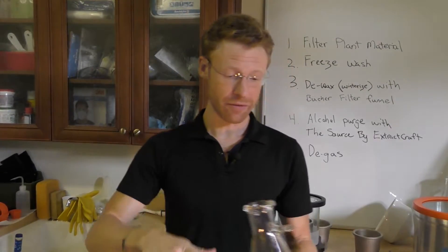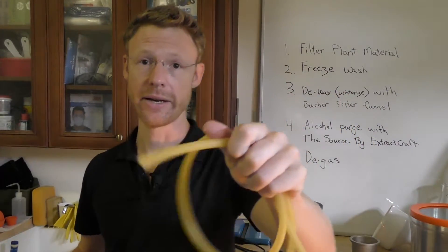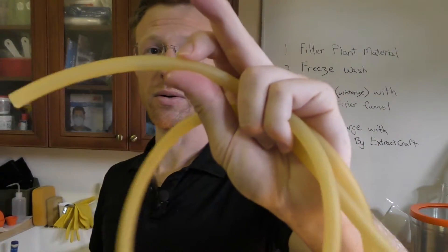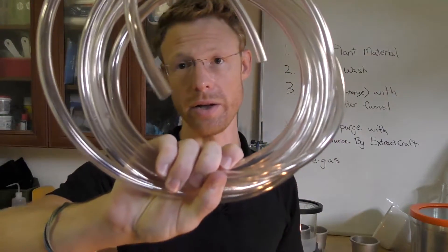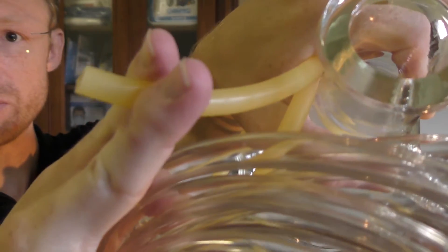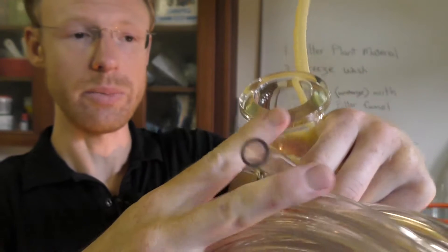I also have some advice in terms of the filter flask tubing. The wall on this tubing is very thin and it was crimping. I highly recommend going with a thicker tubing — you can see how I'm squeezing it right there. It's much less likely to crimp with heavy wall tubing.